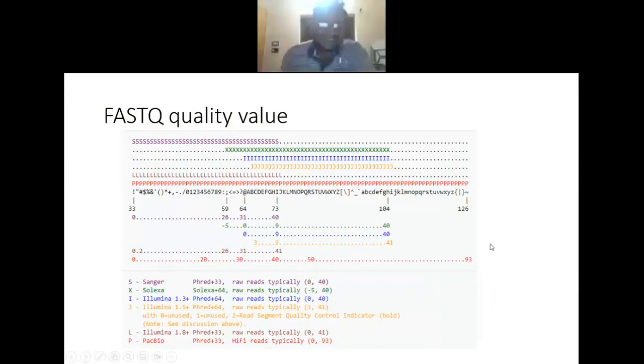Okay, thank you, sir. So what are the first 4 lines, like the letters in the first 5 lines? So this is nothing, they are just the Illumina. This is denoting the Sanger encoding. This is for the Solexa, which starts from 64. Phred 64, Solexa plus 64 starts from here. And these are the ASCII characters. These are the characters, and they are converted to the ASCII values. That's how the Phred plus 33, Solexa plus 64, the encoding names were given, based on the ASCII values.